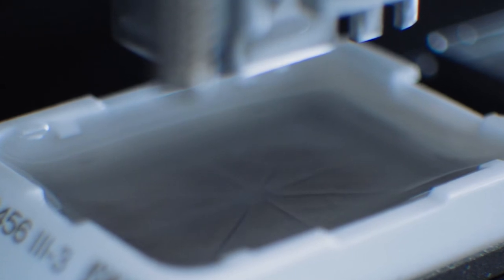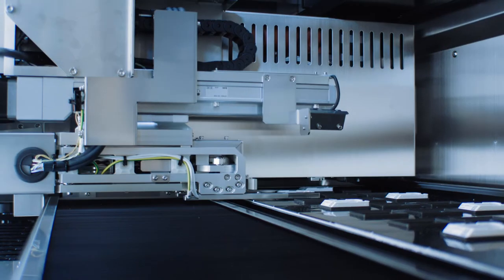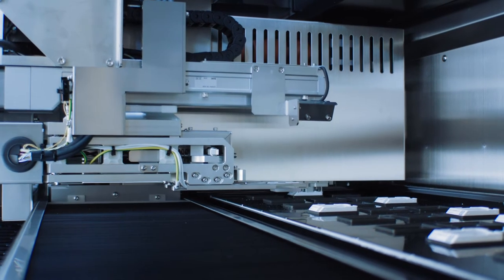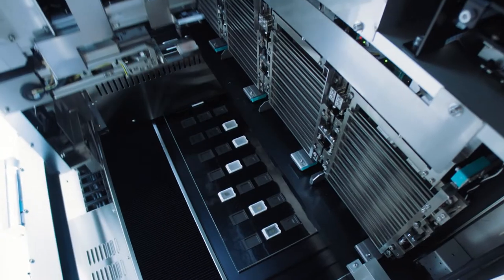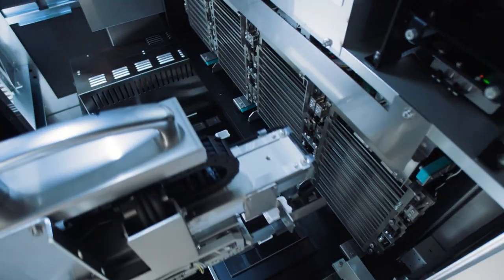Imagine 120 blocks per hour being automatically embedded, ready for Microtomy.